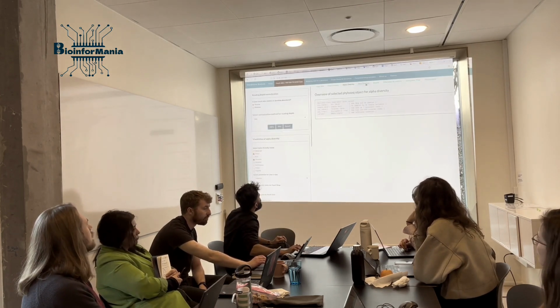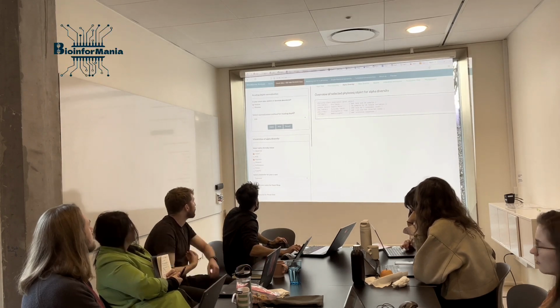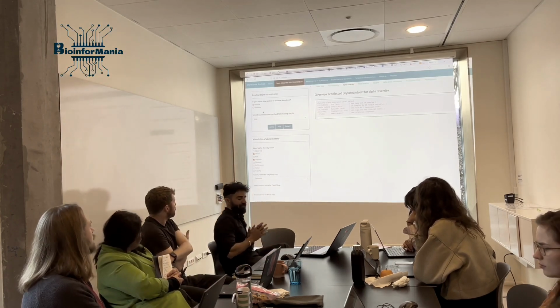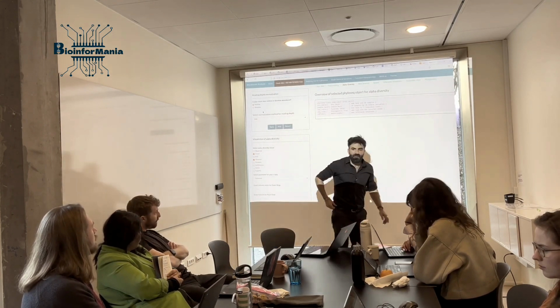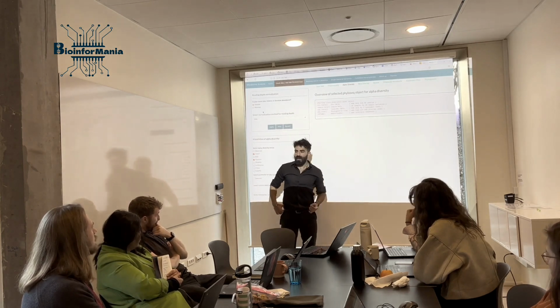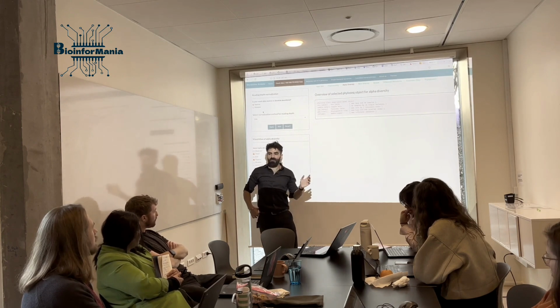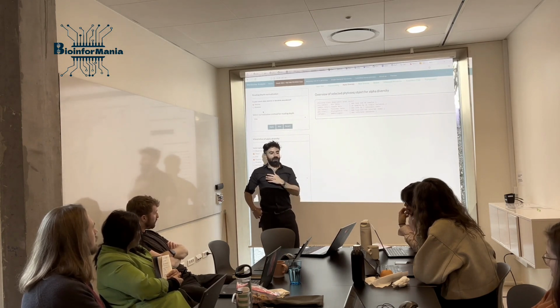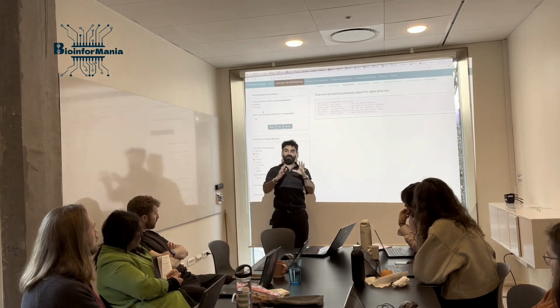Then we go back to alpha diversity, and first and foremost, we need to take into consideration that when you sequence samples, let's say you have two absolutely identical samples, the same femtomolar amount of DNA, the same sample, the same barcode, everything is supposedly the same.